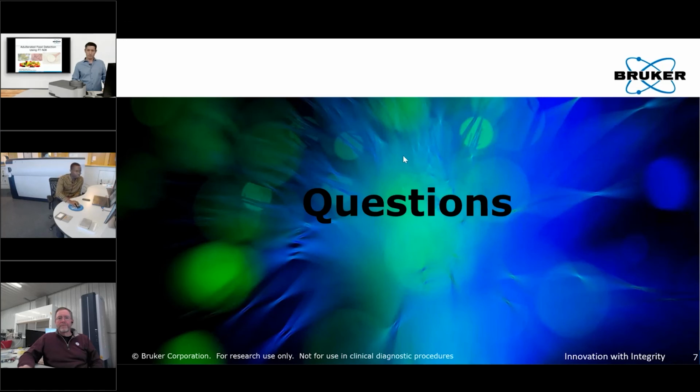So guys, I have a few questions here. Question number one, I think this goes to Chris Krueger. It says, can all samples be analyzed as received?